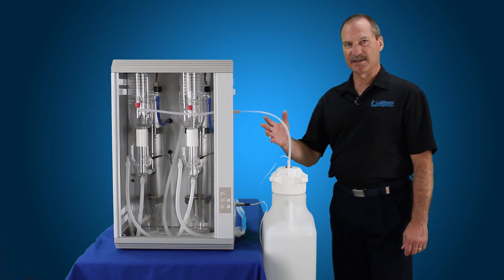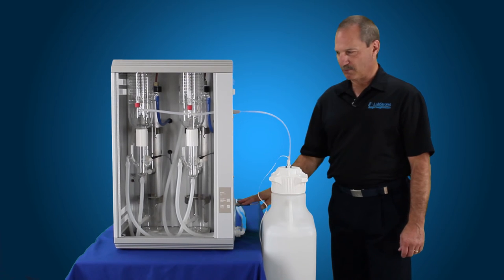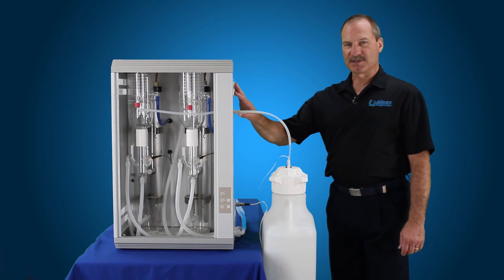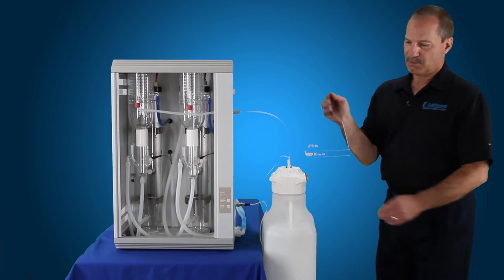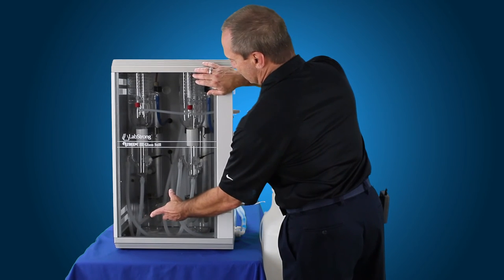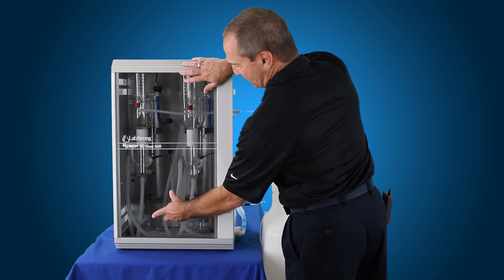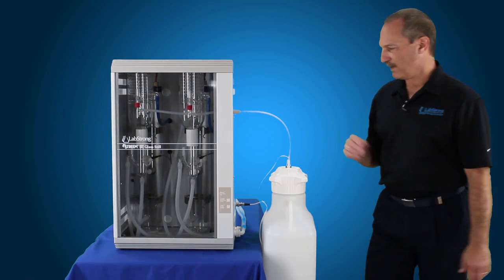Now that we have everything connected — our water, our distillate connected to the tank, overflow, and our float switch — we're ready to operate the system. But before you do that, always make sure you put the door back in place. Simply take the door, slide it up into the top slot, then slide the bottom into the slot down at the bottom. Your door's in place and you're ready to operate the still.